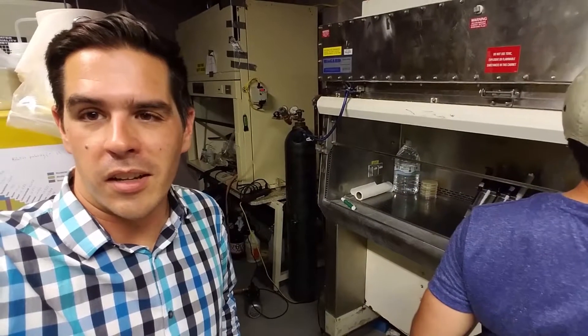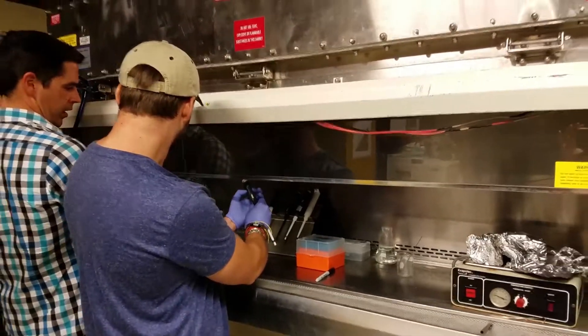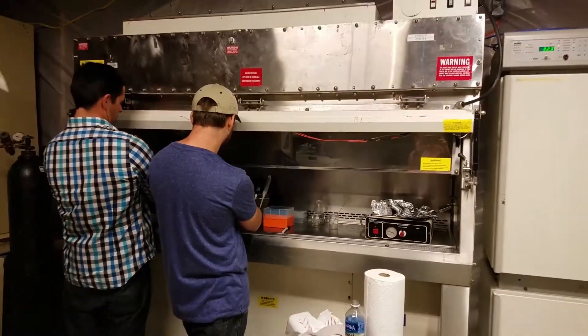It's 8:30. The hood has worked, the incubator hasn't, and we'll come back in about three days.